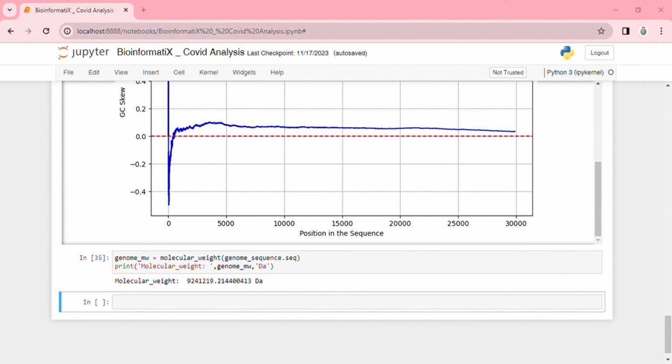But why is K-mer useful? It helps us find patterns in the text. For instance, if ATG appears many times, it might be an important pattern in the genetic code. In DNA sequencing, we can use K-mer frequencies to find and correct errors in the sequence. When we're studying genomes, understanding K-mer frequencies can help us assemble the genome correctly. In addition, it can also help us spot differences between different organisms' DNA.